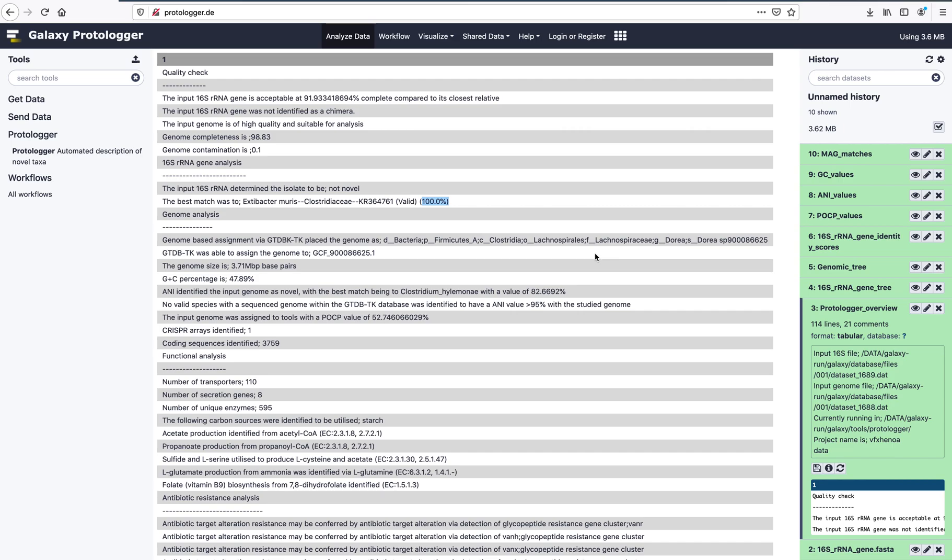To further look into this, the genome analysis is studied further, which suggests the isolate belongs to an unnamed species of Doria. The genomic novelty of this isolate is further supported by all ANI values being below the species threshold of 95%. The percentage of conserved proteins, or POCP value, is above the genus level threshold of 50%, suggesting this isolate belongs to a known genus.